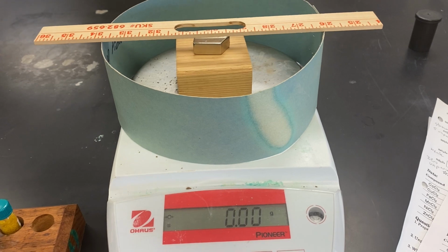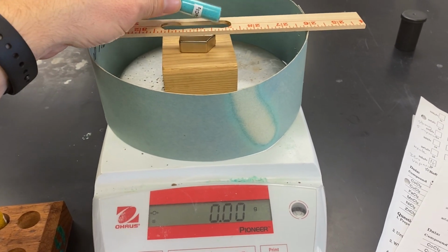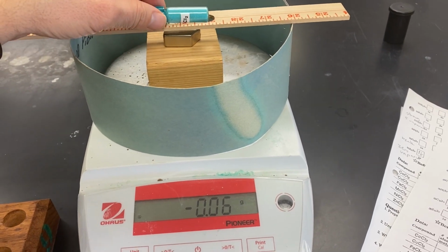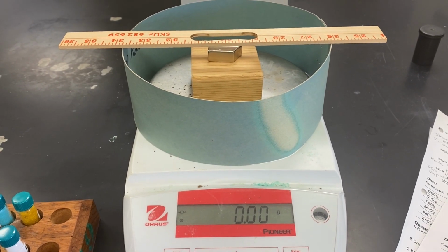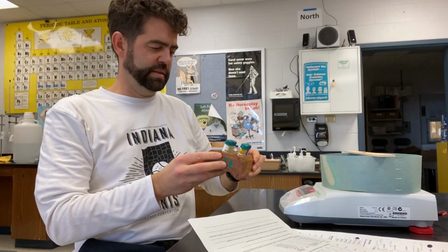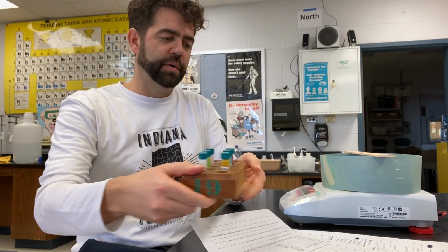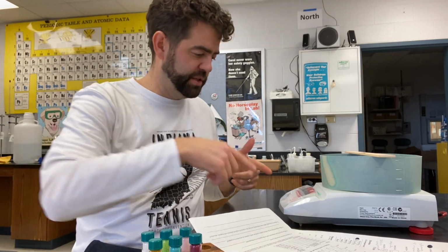Ooh, good. So then I can test different samples and see how they react there. And you can see some are different, and that's what we're really paying attention to. So I'll give you a close-up view of what's going on. And I'm just gonna go through all these different samples and kind of give you the readings as we go. So let's get busy here. I got this block of samples here. I'm just gonna go in order of what your table says. So make sure it's zeroed out.